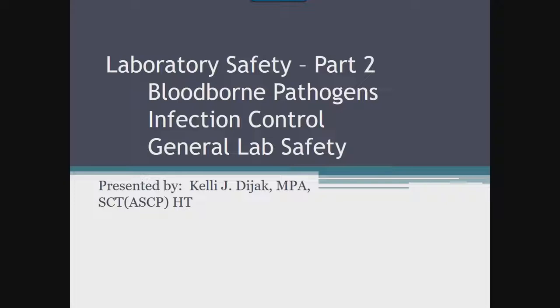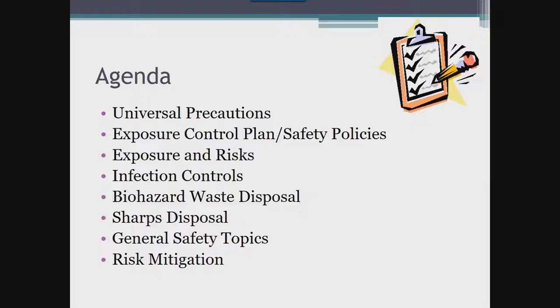This presentation is part two of a two-part series on laboratory safety. In this second part, we are going to focus on bloodborne pathogen safety and then hit on several general lab safety topics. The agenda for this afternoon will include: universal precautions and the purpose of the exposure control plan and safety policies; exposures and risks found in the laboratory and infection controls in place to protect against them; biohazard waste and sharps disposal; several general safety topics — the balance from part one; and finally, some risk mitigation processes and tools.